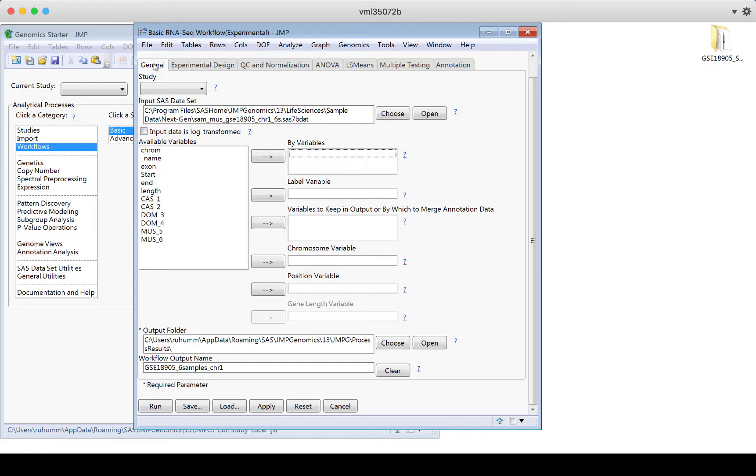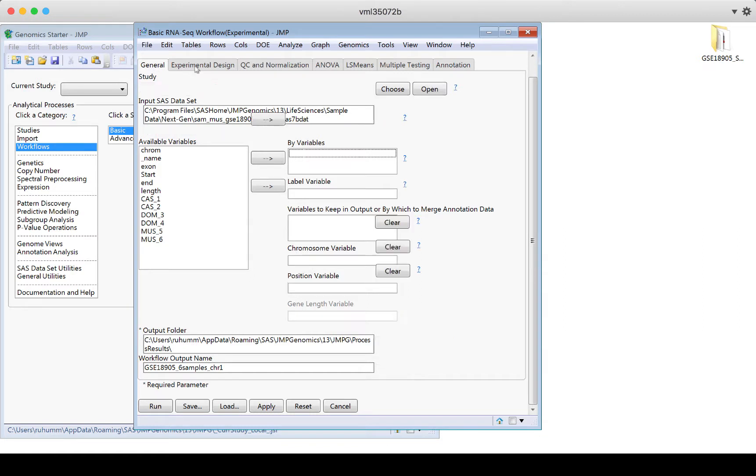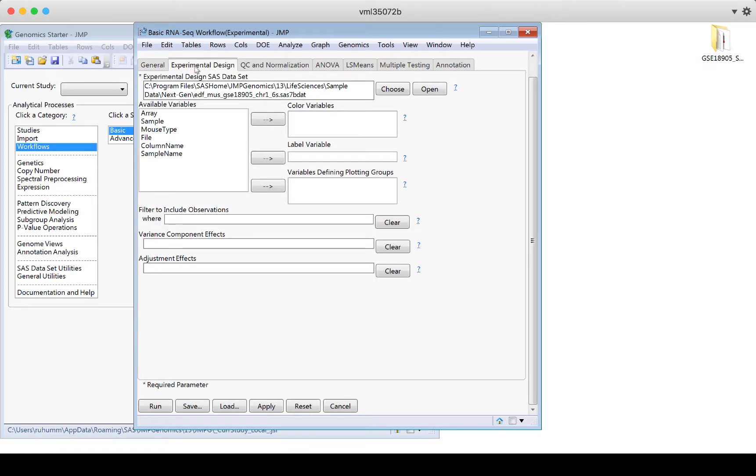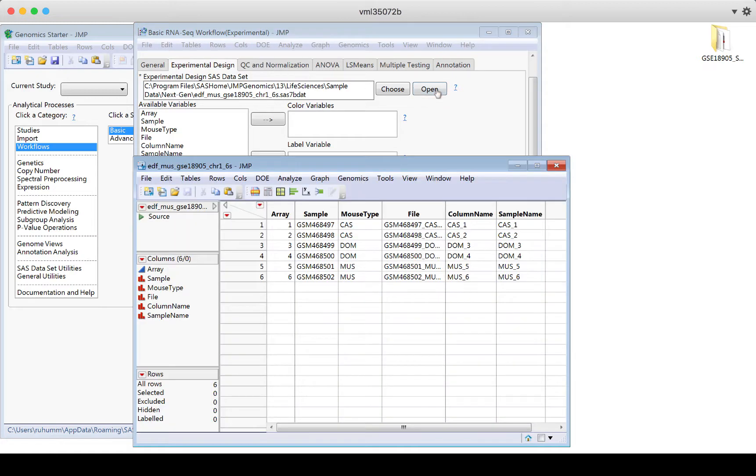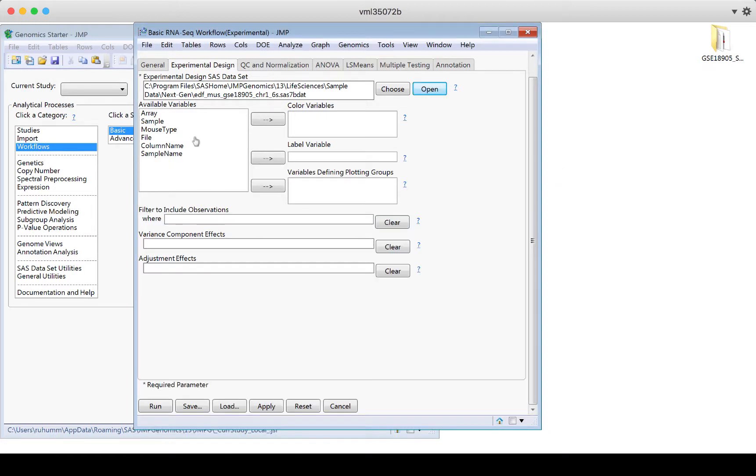So if we go through general and then experimental design, here we see the experimental design data set. This was a case where that was necessary. If I want to look at that data set, I can click open and I'll see that data set. This is exactly the example I've been showing you. I can again choose to move things into these boxes, but I don't need to in this case.